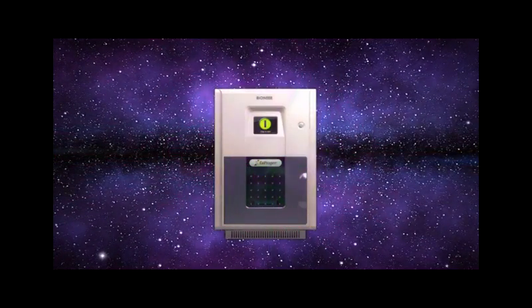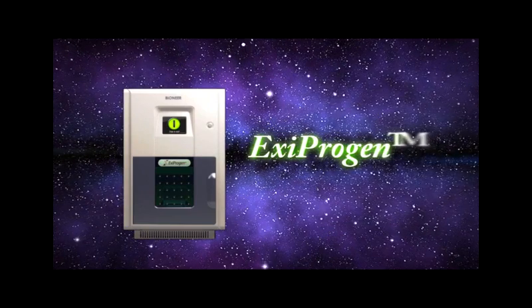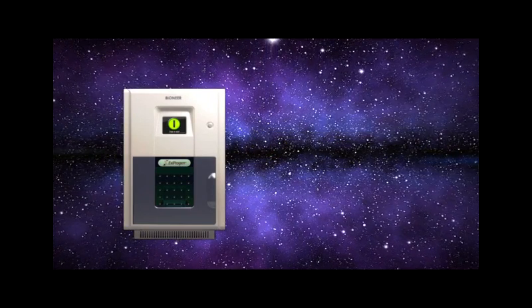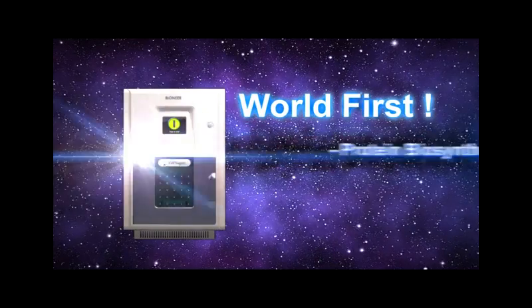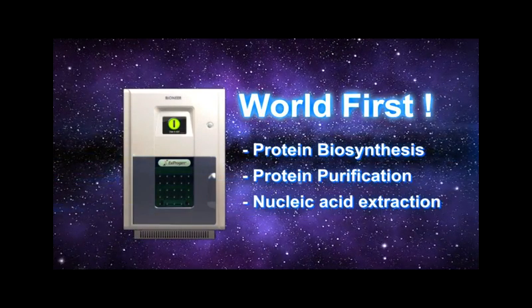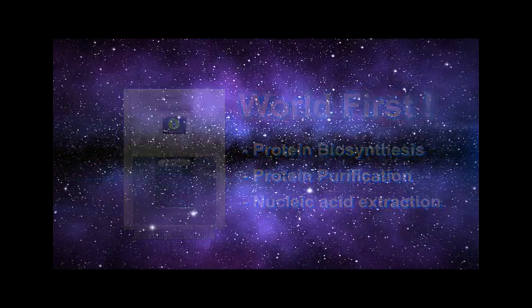Exiprogen is the only automated system that can make purified protein from DNA in 6 hours, as well as purify nucleic acids. Exiprogen is the world's first instrument that automates protein biosynthesis, protein purification, and nucleic acid extraction.